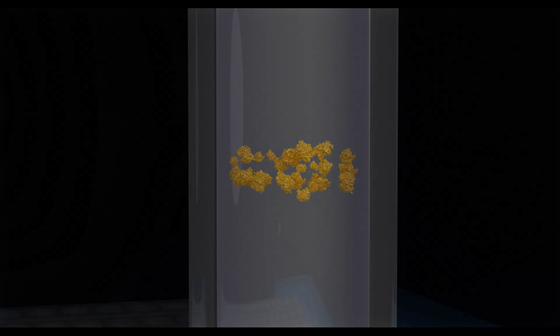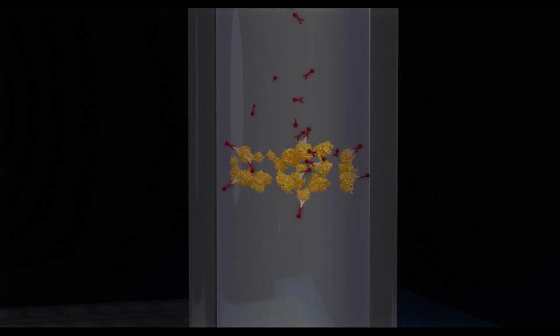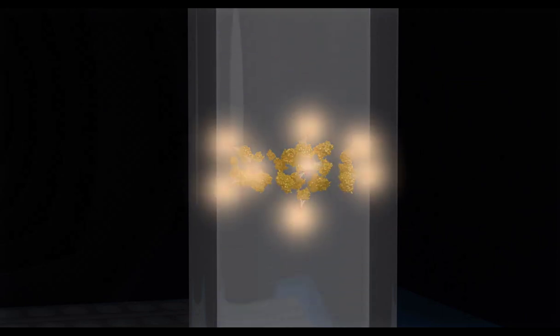For chemiluminescent detection, samples are first incubated with the primary antibody, followed by a secondary HRP conjugate, and finally chemiluminescent substrate. The chemiluminescent reaction is recorded by a CCD camera in a series of images over time. For fluorescent detection, samples are incubated with the primary antibody, followed by infrared or near-infrared fluorescent secondary tagged antibodies. Excitation of the fluorophores releases photons, and the emission spectra is detected and recorded by a CCD camera in a series of images over time.